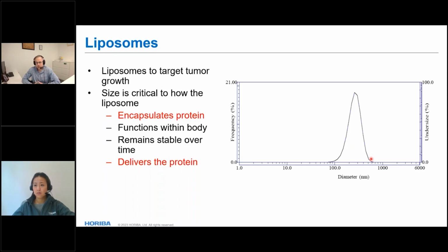You're probably going to have to move to nanoparticle tracking analysis to get those sorts of details of size distribution. The underlying reason is that we're bringing all of the light into a single detector and then sorting it back out with a mathematically hazardous procedure, which gets you some great benefits, but D97 and D90 are not two of them.